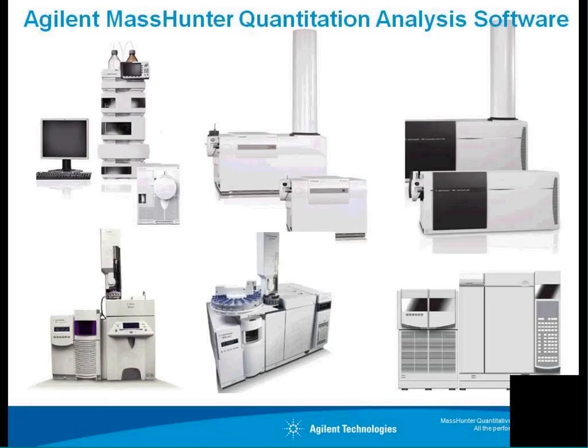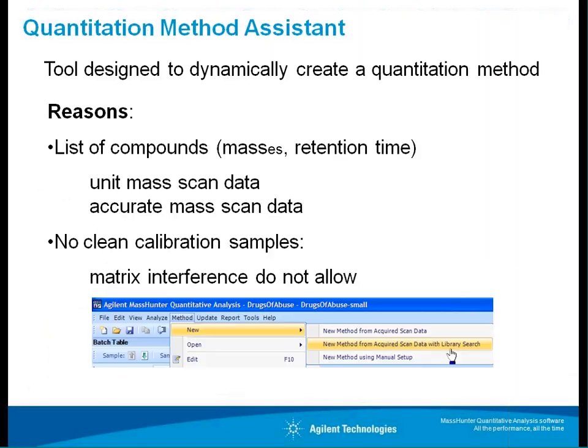Welcome to the analysis software, and I'd like to discuss a tool that can be quite useful to you. I'm going to call the tool the Quantitation Method Assistant. This tool is designed as a standalone tool to help you dynamically create a quantitation method.